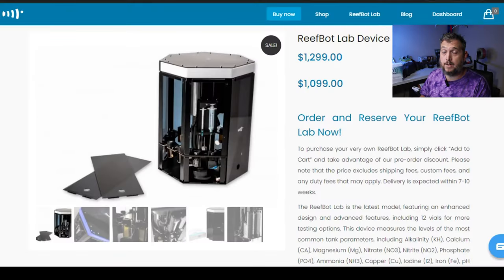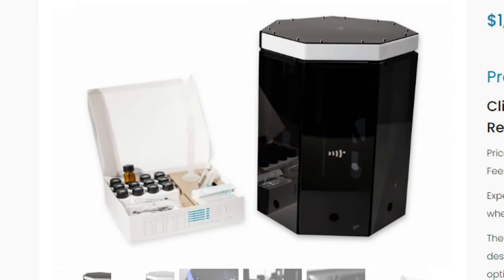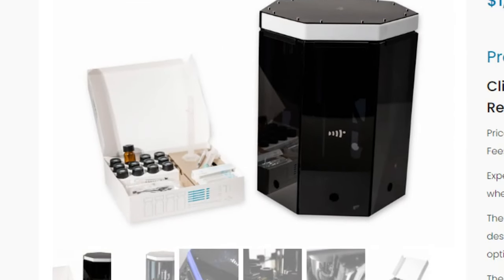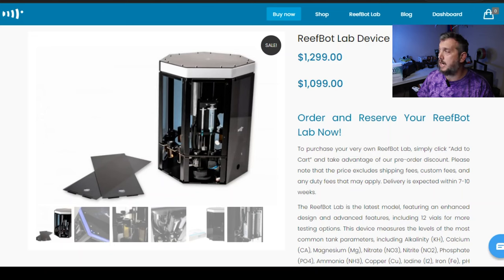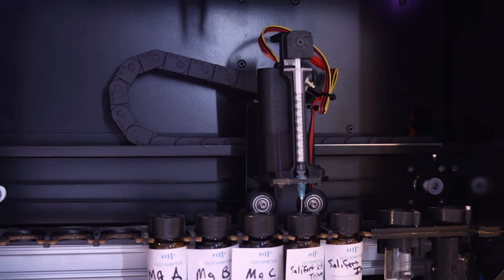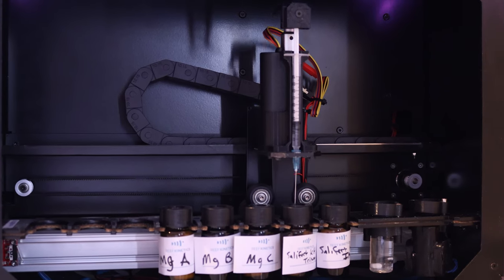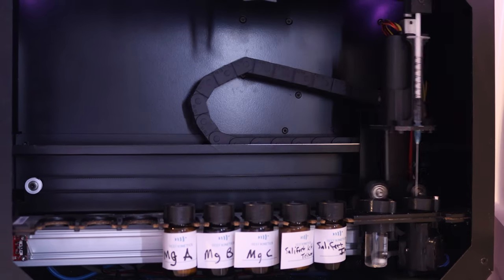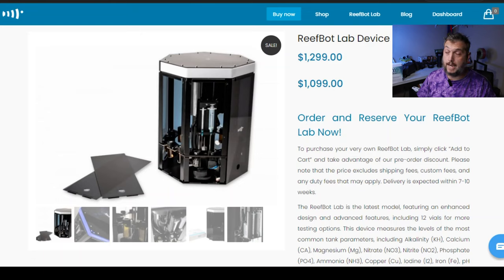The new ReefBot Lab here has an enhanced design and some advanced features to it. It includes 12 vials for more testing options. The one that I have currently only has 8 slots for you to fill up to test for. So this gives you a few more tests that you can use with the 12 vials versus the 8. When you use a ReefBot or in this case the ReefBot Lab, certain test kits use more vials than others. Some will use 2, some only use 1, and some use 3.